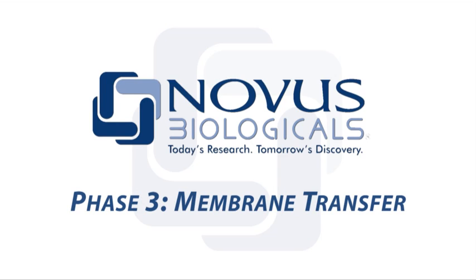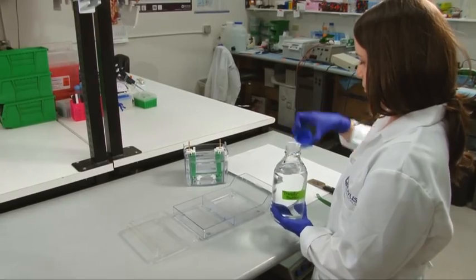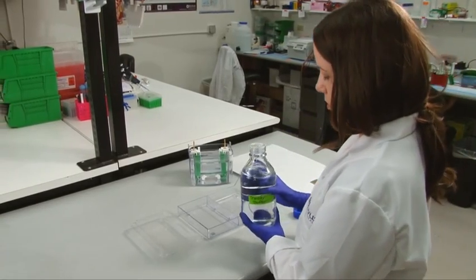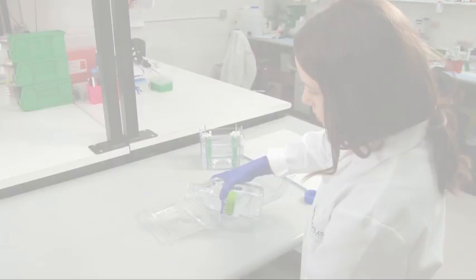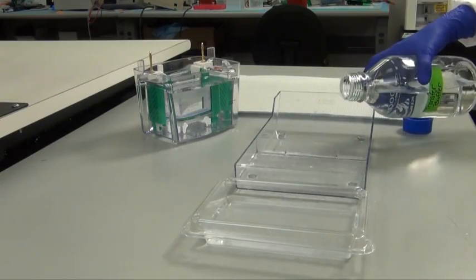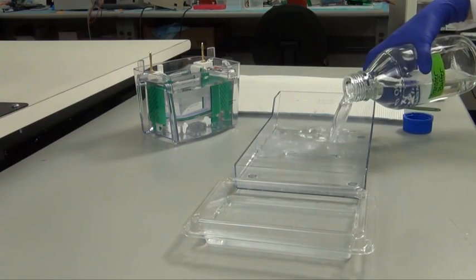In this next step, we will transfer our separated proteins out of the gel and into a solid membrane or blot. This is based upon the same principle as the previous step in which an electric field is applied to move the negatively charged proteins towards a positive electrode.